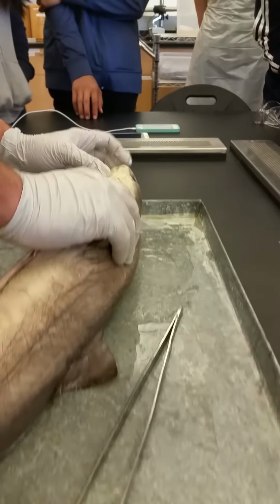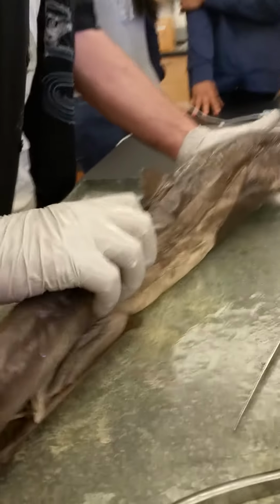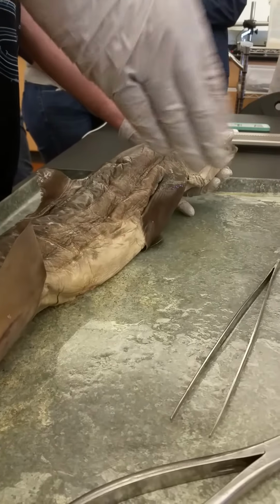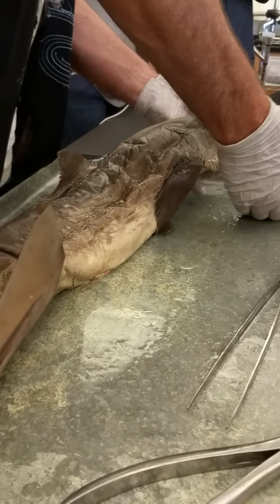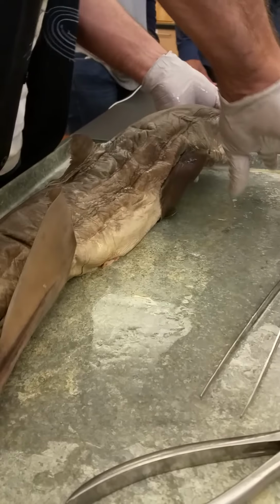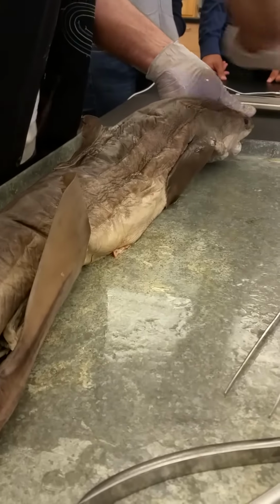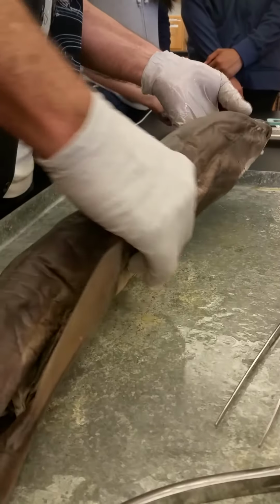They're so sensitive that they could be swimming over the surface of the sand and detect if there's a fish buried in the sand underneath, just by the nerve action stimulating the muscles to ventilate its gills from that fish breathing. That creates enough activity, and these things can detect that. For example, a hammerhead that eats rays or flatfish buried in the sand, the big head looks like a minesweeper, and that's what they're doing. They're looking for electrical fields under the sand, and they can tell they're there and then dig them out.